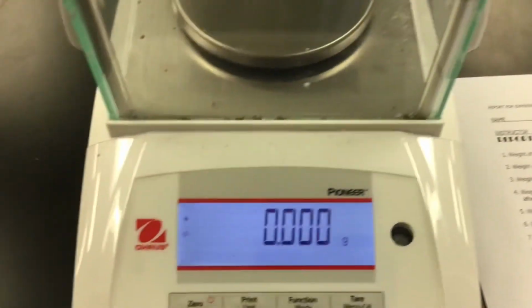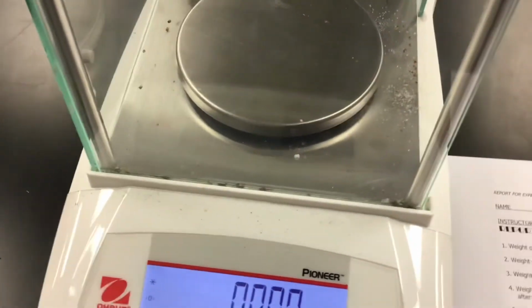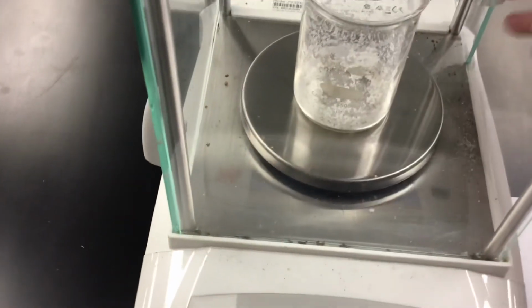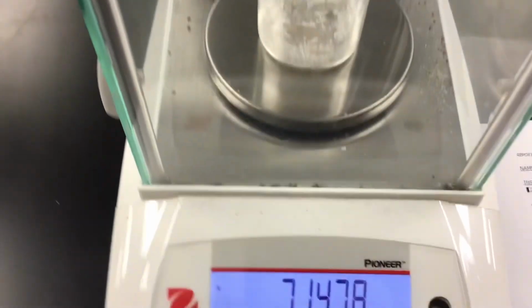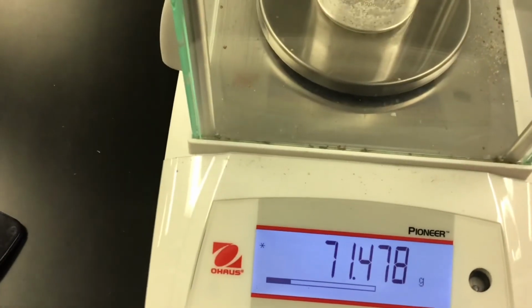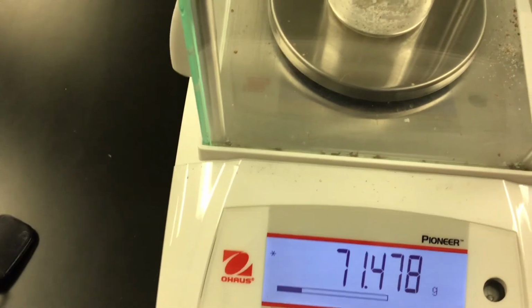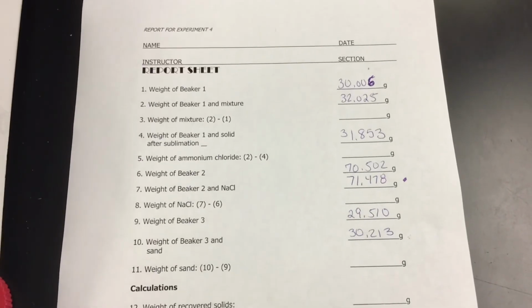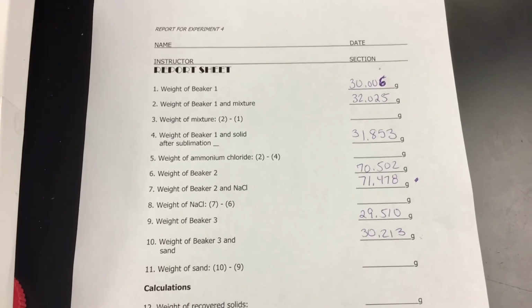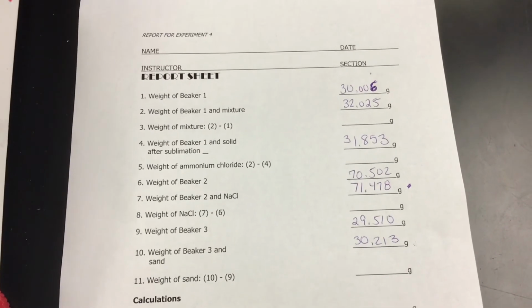Okay, so now it is cool to the touch. I have 0, so I'm going to put that right on there, and then I'm going to look at the amount. So this is for my salt water. It's going to be 71.478. Okay, and so I just put that right there. Number 7, the weight of beaker 2 and sodium chloride, 71.478, in spot number 7.